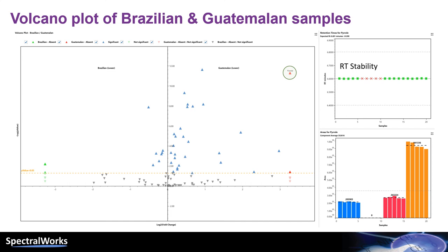Using the combination of PCA and Volcano plots, Analyzer Pro allows us to quickly compare how components behave over the entire sequence in an objective manner.